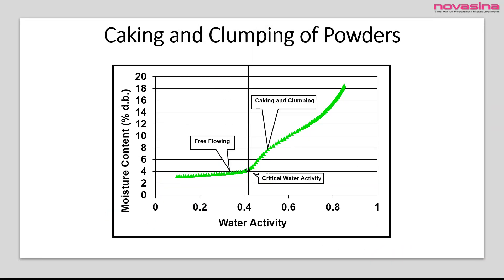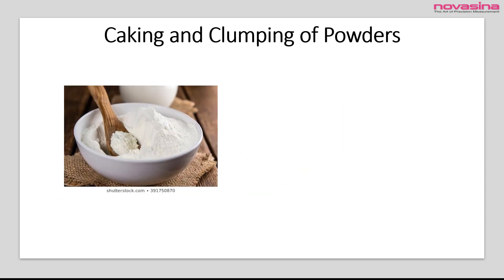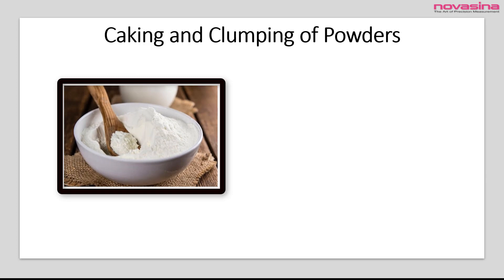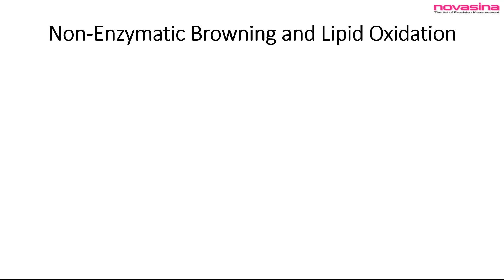Did you know that you can control the caking and clumping of powders using water activity? There is a unique critical water activity for each powder where caking and clumping will start. At water activities less than this critical value, the powders will stay free-flowing, but at water activities higher than this value, the powders will get sticky, resulting in caking and clumping. This critical water activity decreases with an increase in storage temperature and has a strong association with glass transition.